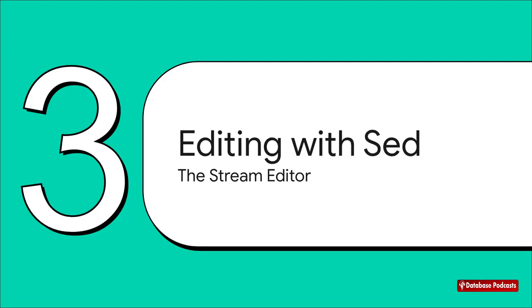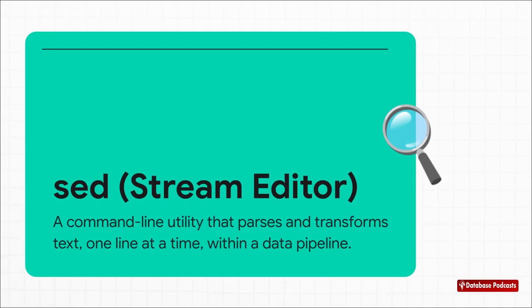Okay, that's awesome for pulling data out. But what if I need to make a few little changes? You know, like cleaning up a messy header or reformatting a column before I pass it on to another program. For that, we bring in our second tool, Sed, which stands for Stream Editor. You can think of Sed as a super fast surgical find and replace that works on your data as it's flowing by. It is perfect for making those quick, precise little tweaks right in the middle of a pipeline.